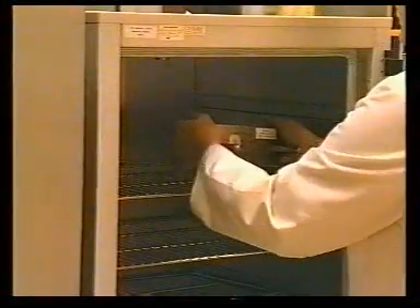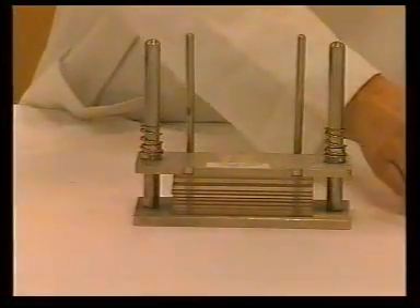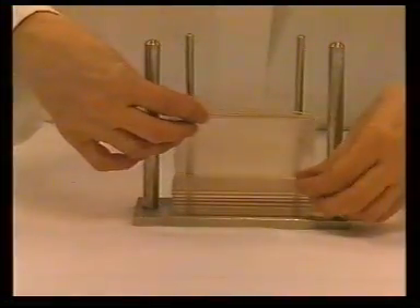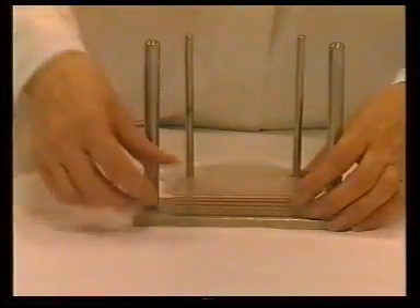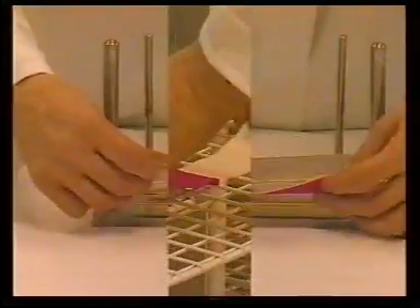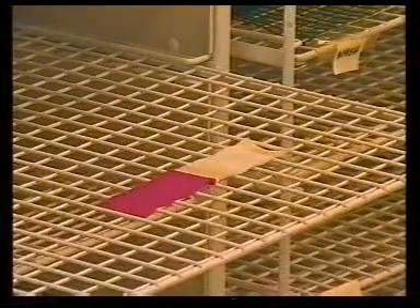The units are removed, the top plates released, and the composite test specimens removed and laid out on the drying racks with the specimens not in contact with the multi-fibre strip.